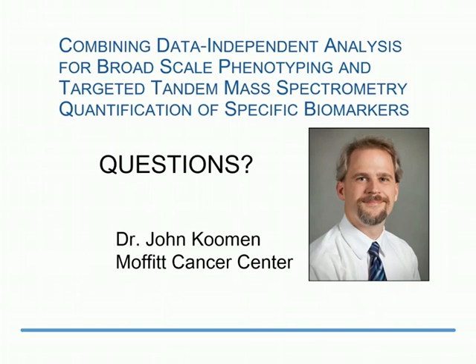And we do see those very consistently across. Once you're counting mainly on the MS1 quantification, with the exception of the targeted tandem mass spectra, if you have the accurate mass and time of that peptide, you have pretty good confidence. Many of these samples are fairly consistent in overall background, with minor biological changes. You feel pretty confident in assigning those peptides when they have that particular set of parameters, and we've done that with a number of different strategies. We don't feel like we have to have identification every single time.